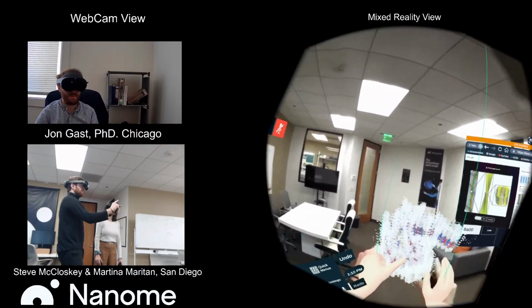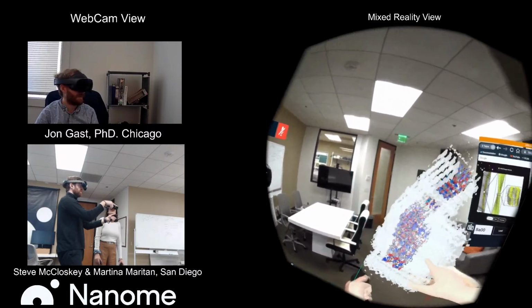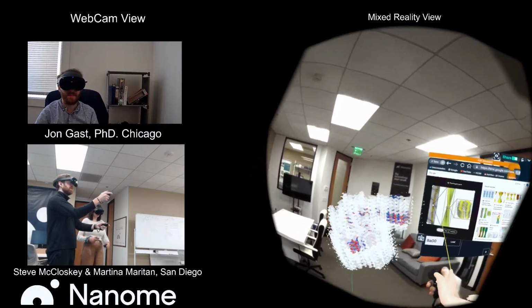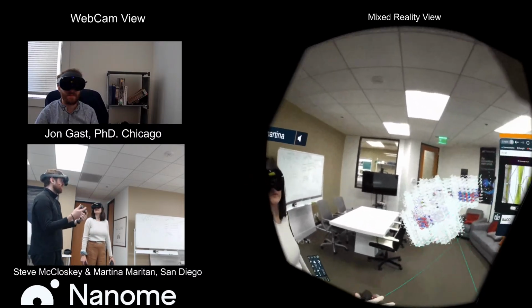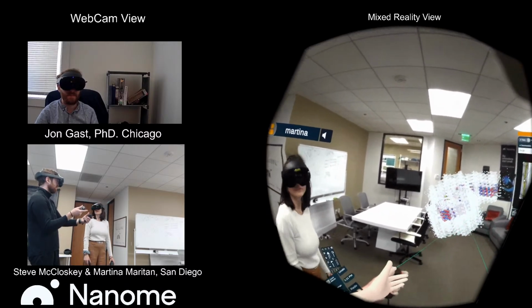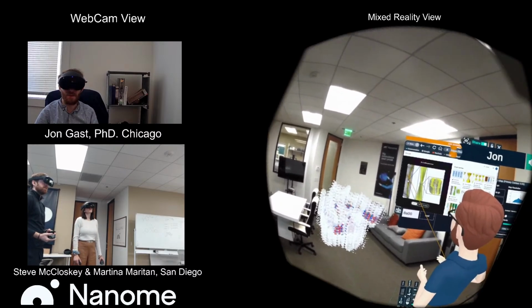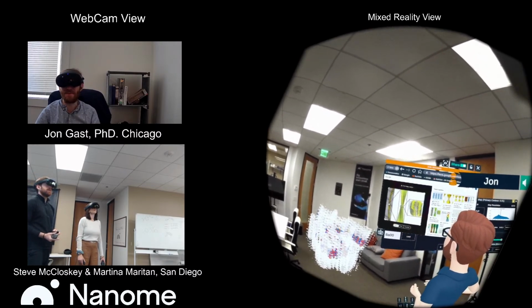And you're saying it's not that the individual protein is toxic, or that any part of it is necessarily bad, but the overall structure that it forms can be very biologically damaging and prevent biological functions, and that could be very dangerous and toxic. That's right, absolutely. And this picture even shows, from the microscope, how large we're looking here.